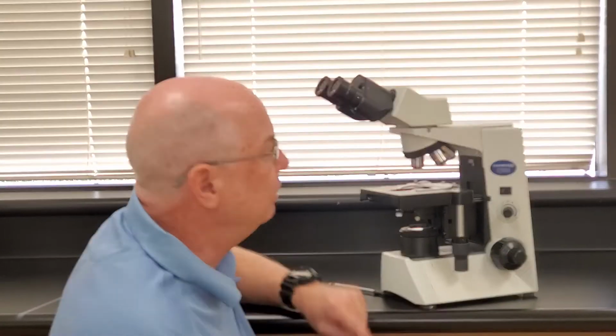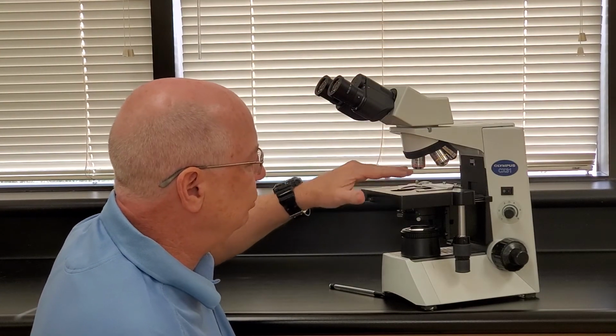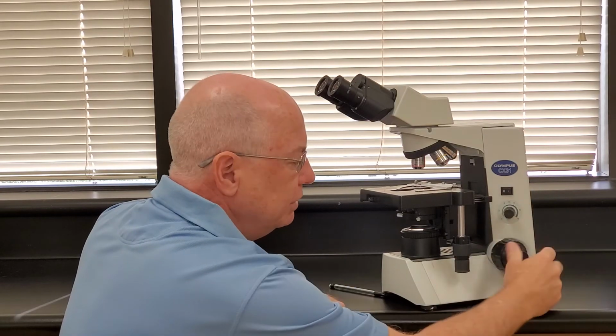Do this till you can't stand it. Do it till you can teach everyone all the parts of a microscope, and then do it 5 more times. Again, you got to want this stuff, and you have to be putting in a lot of time perfecting it to where you could look at a microscope without any list available and go ocular, revolving nose piece, objectives, stage clip, stage control knobs, lamp, condenser, on-off switch, light control knob, coarse focus, fine focus.